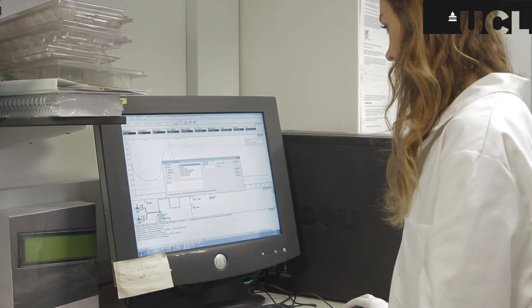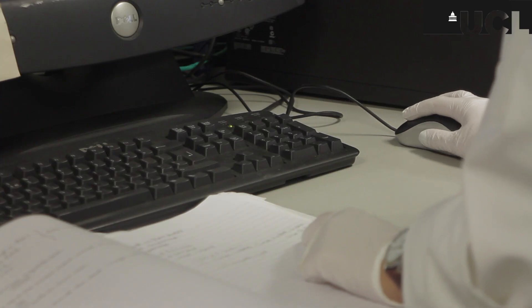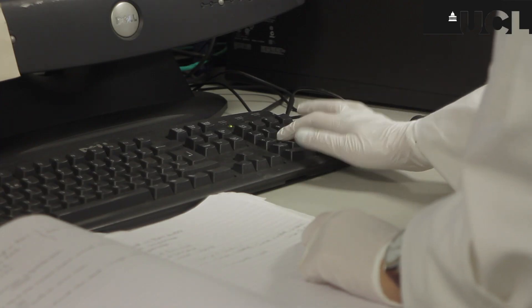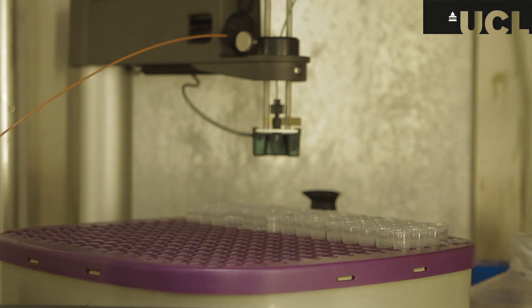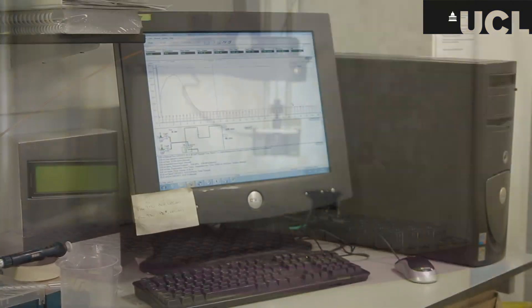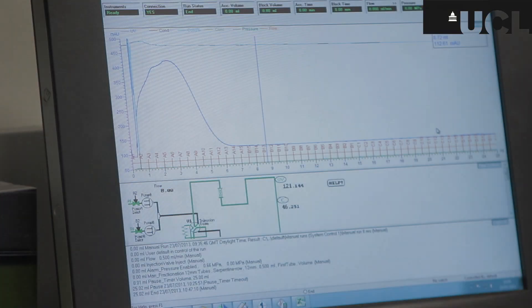The machine has been programmed to collect fractions of 0.5 ml in the hope that our protein will be isolated. The machine uses absorbance measurements to identify the location of our protein. A peak can be seen on the monitor, and this represents our isolated and purified protein.